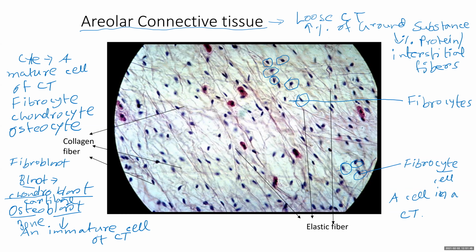Let's look at this area here. If you focus on the fibers going in every direction, here, here, and then here, then here, the thinner ones. Now focus on the heavier one, that one, wider, heavier looking. There aren't that many of those. So these crisscrossing thin ones are the elastic fibers, while this heavier one here is the collagen fiber.